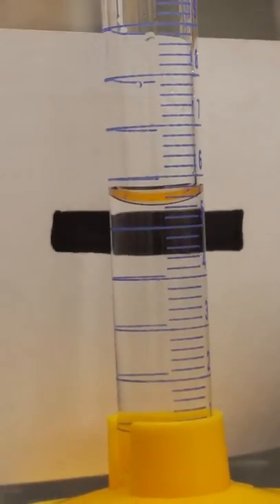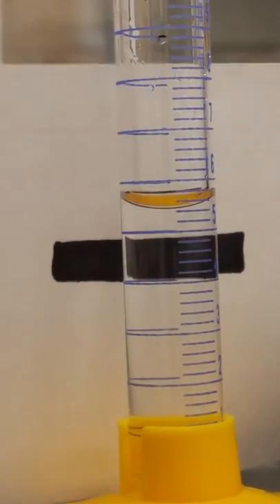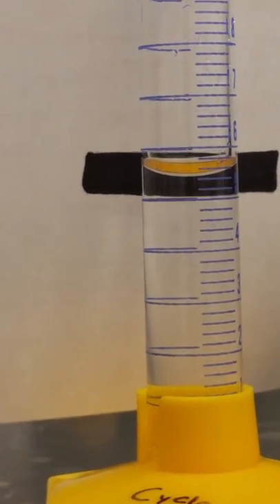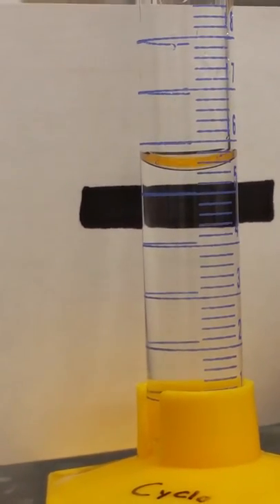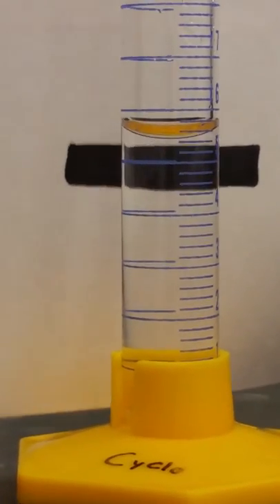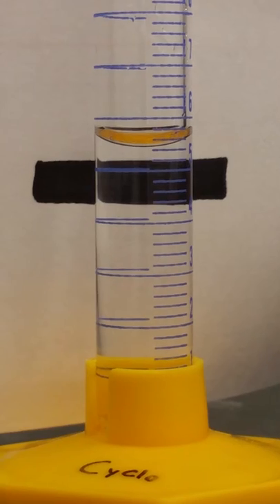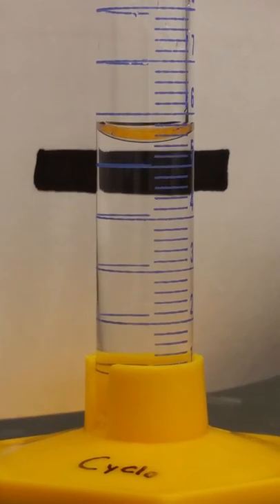You start out by deciding what your first number would be. Because it's between the 5 and 6 milliliters, it's going to be 5 because it's less than 6. So then your first decimal place, you're going to choose it based on what the smaller lines are.